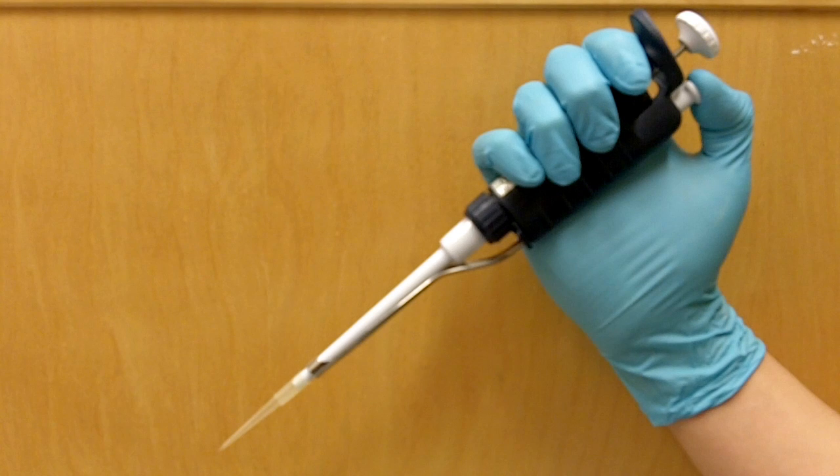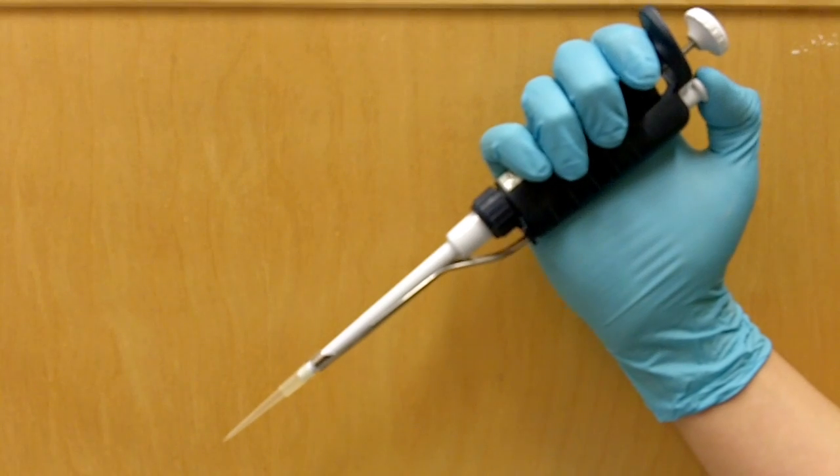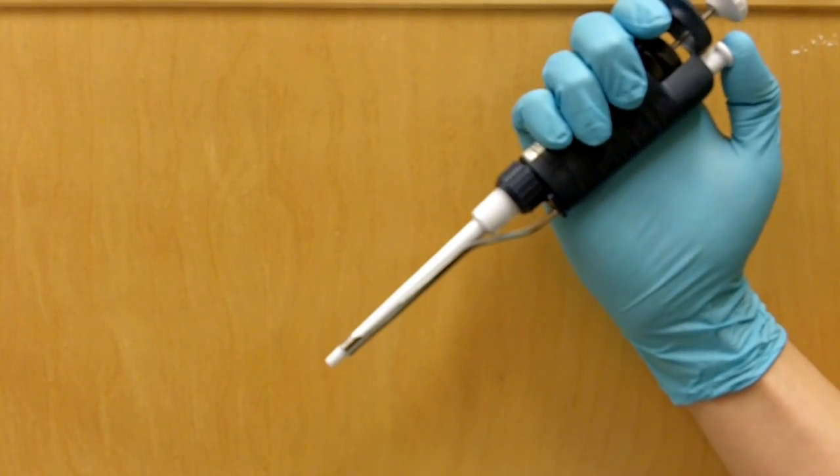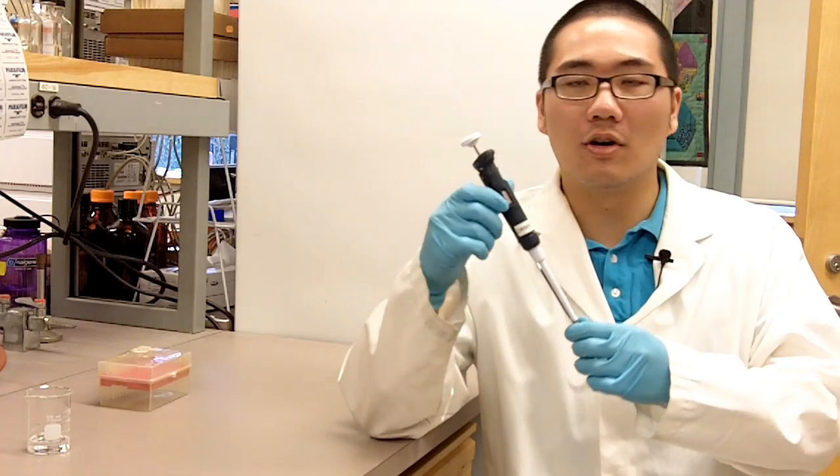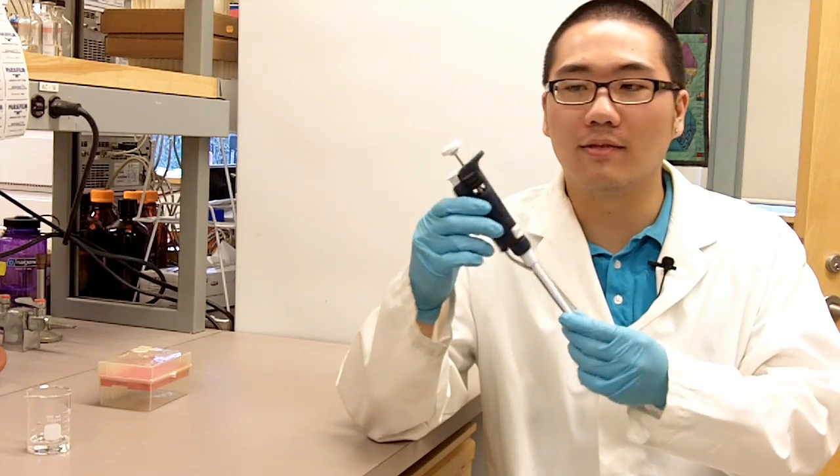And then to eject the tip, all you have to do is press the tip ejection button like that. Now you know all the basic parts of the pipette.